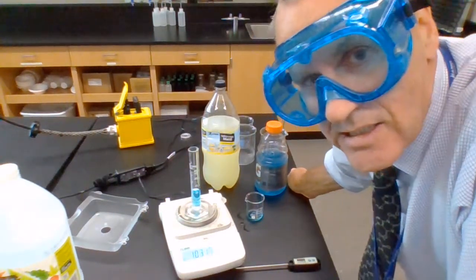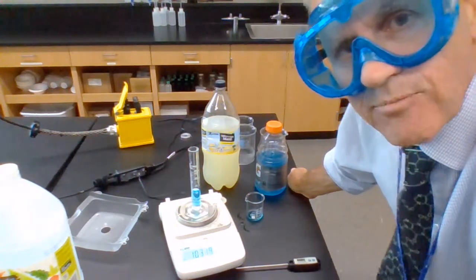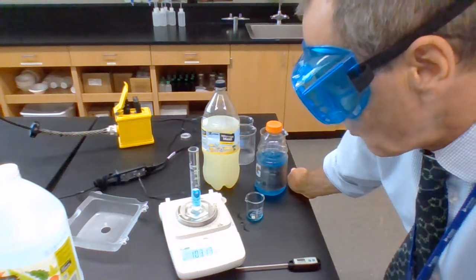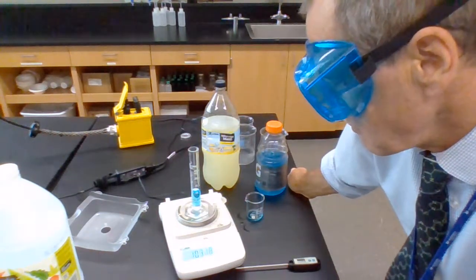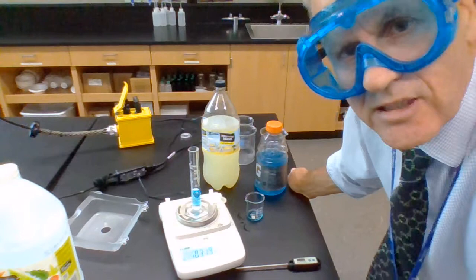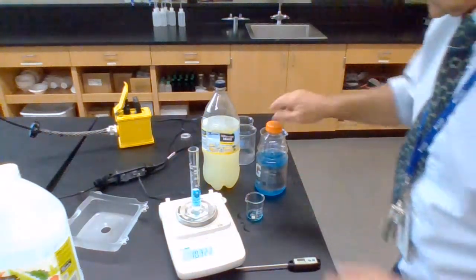A milliliter is the same as a cubic centimeter. So this is, let's divide it by 10. It is 1.031. And let's forget about the last decimal point. But we've got a density in grams per centimeter cubed. That's nice. Now we do it again.